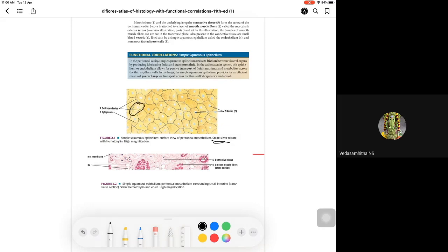This is the cell border and this is the nucleus and this is the cytoplasm. Remember, I told you when you are describing the individual cell, first cell border, second cytoplasm, third nucleus. You have to remember that. And here, what do you think, Maveda, amount of cytoplasm? What do you think the cell border? Is it distinct or indistinct? It is distinct. Super, ma. And what is the cytoplasm quantity? It is abundant, sir.